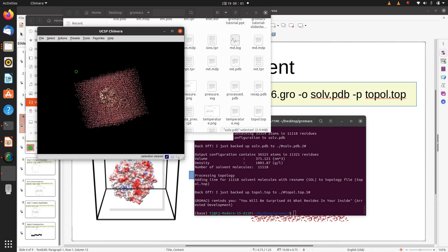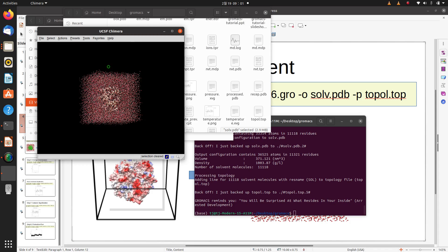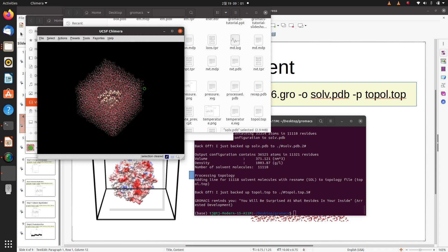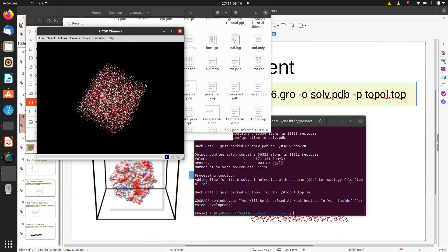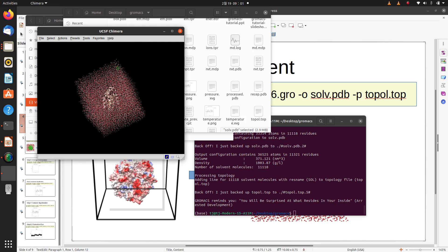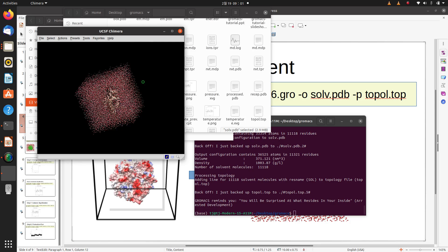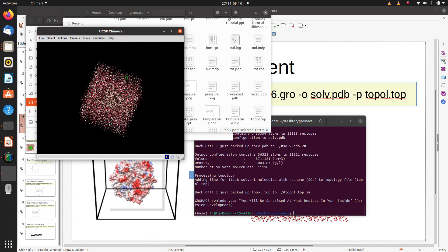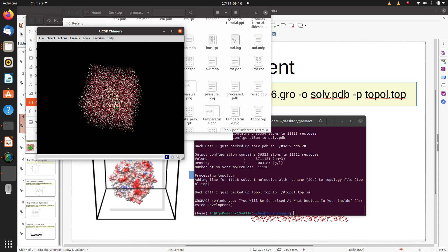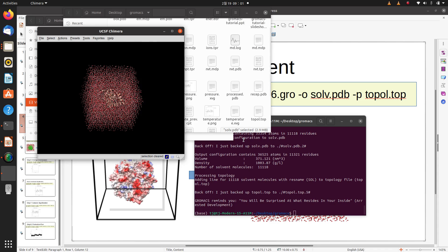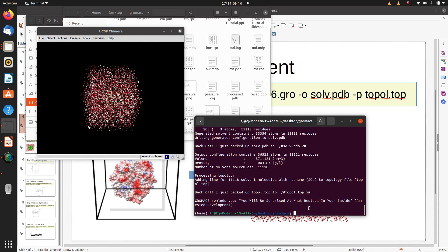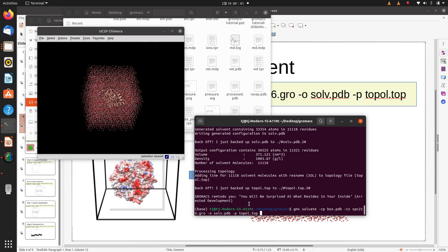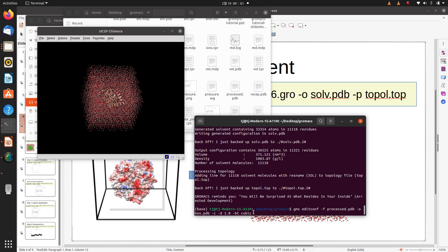The box is cubic in shape. You can also use triclinic, rhombodentric, or dodecahedron shapes by specifying the box type in the editconf command.